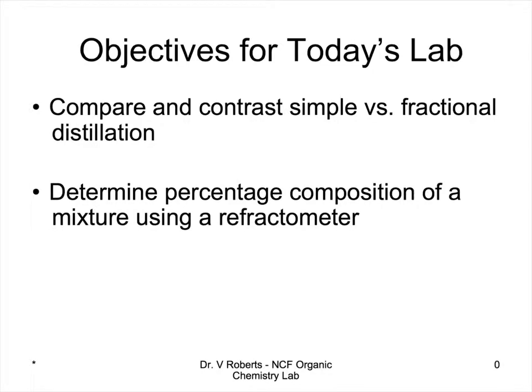So, to reiterate, the objectives for today's lab would be to compare and contrast simple versus fractional distillation. And we're also going to be determining the percentage composition of a mixture using a refractometer.